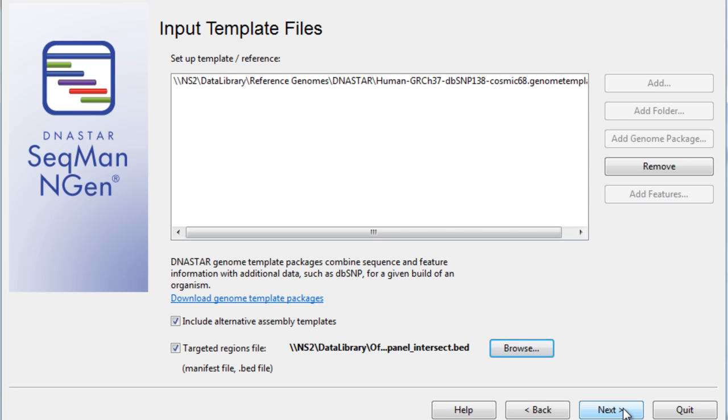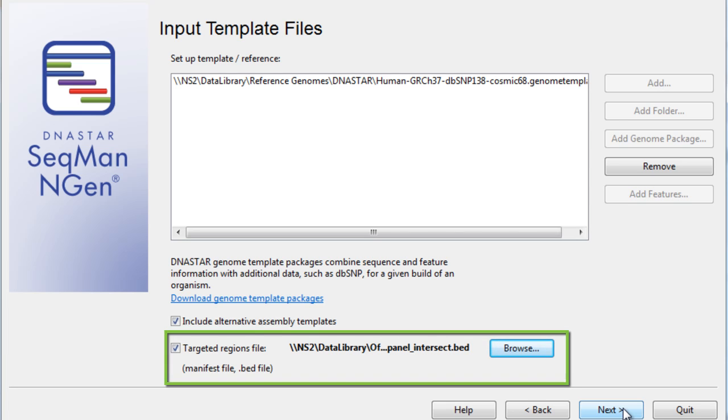The last action we want to take on this particular screen is checking the Targeted Regions file box and uploading our bed or manifest file. This bed file, or manifest file if working with Illumina data, details your targeted regions of interest.